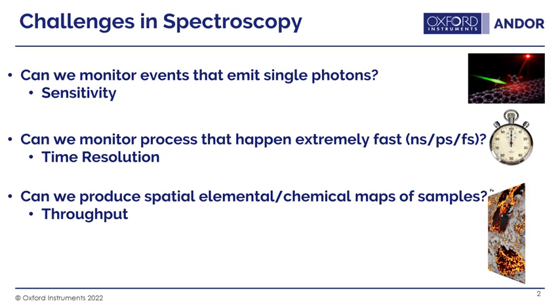The second question is, can we measure things in physics and chemistry that happen really, really fast? 1 billionth, 1 trillionth, or even 1 quadrillionth of a second. Here, you need a setup that has very good time resolution.